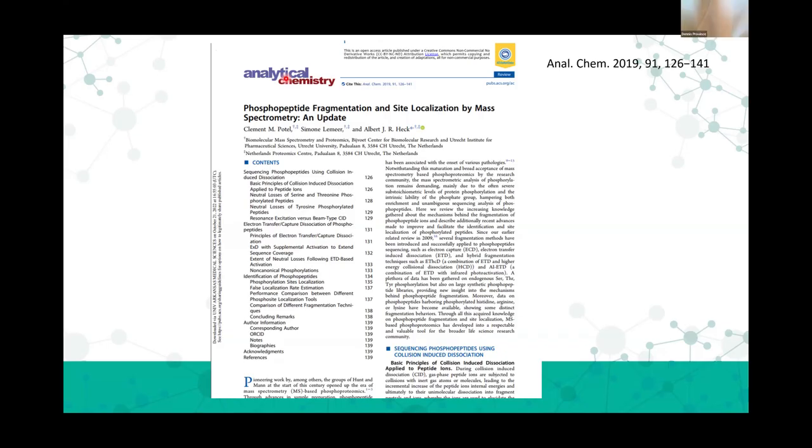I know Thermo does because they sell part of these in what they call a SureQuant kit. So you can look at the MAPK pathway and they have the carbon-13 labeled peptides for those specific phosphopeptides. So I know Thermo does. They're not cheap.